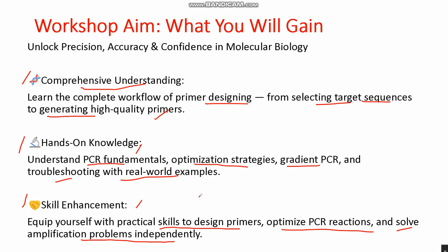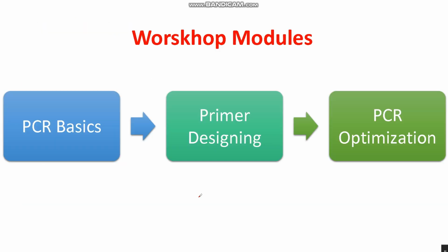So let's start today's workshop. On this slide we have the modules of the workshop. First of all, we go through the PCR basics. Then we talk about primer design, and at the end, PCR optimization. Okay, first of all, let's start with PCR basics.